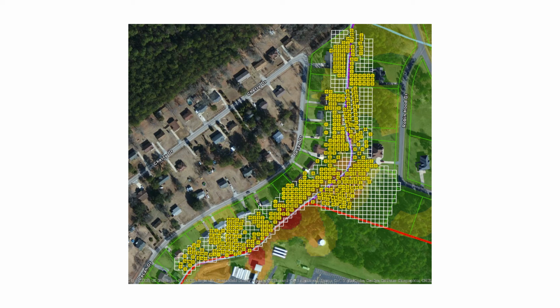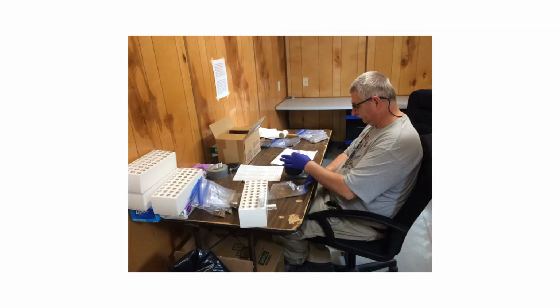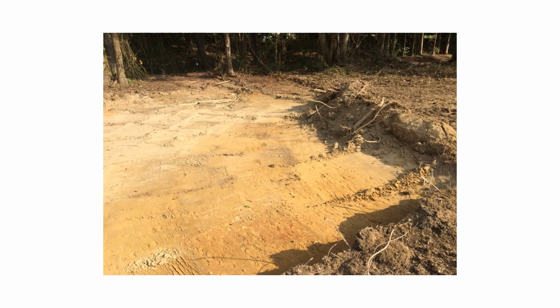A dynamic work strategy was used to determine the horizontal and vertical extent of samples that needed to be analyzed in the field. Samples were analyzed in the field using a commercial electrochemical field analysis method. Correlation of the field samples with lab samples demonstrated that the results met the data quality objectives. Sample results using the HRSC sample and analysis methods were used to refine the estimates of the needed soil excavation. Excavation extent was confirmed with lab samples.